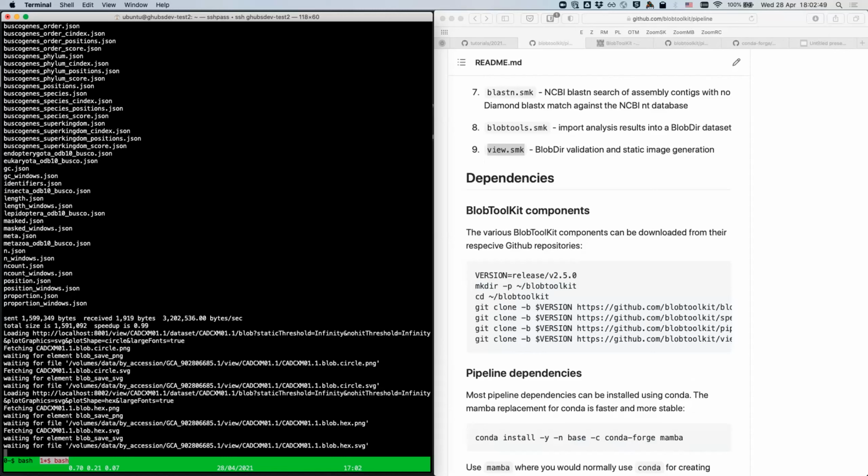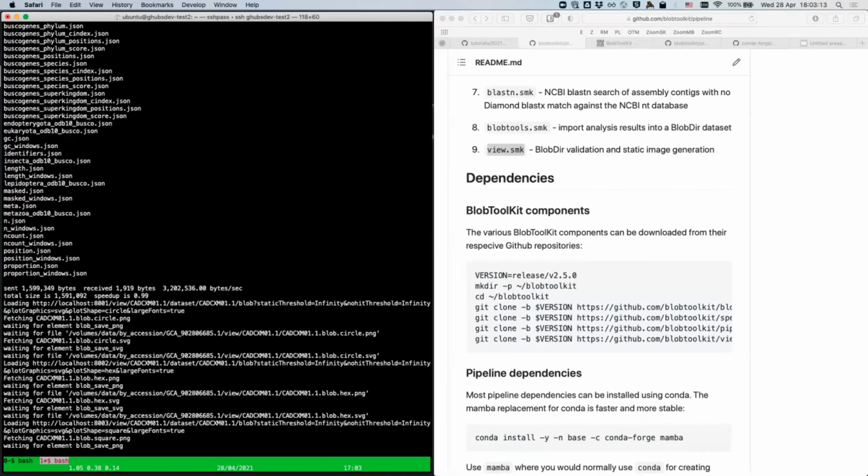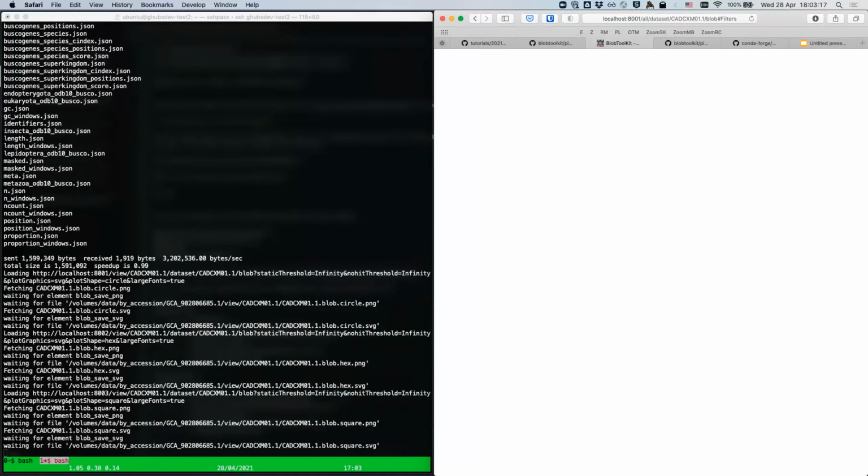It depends on how sure you are of your way of determining what is a contaminant. So what we say is BlobToolKit is only giving you a way to identify the contaminants, but you have to make the call yourself. So let's say, I'm just going to go back in here, go to the viewer and say, I trust that the two, oh, I stopped running it again.